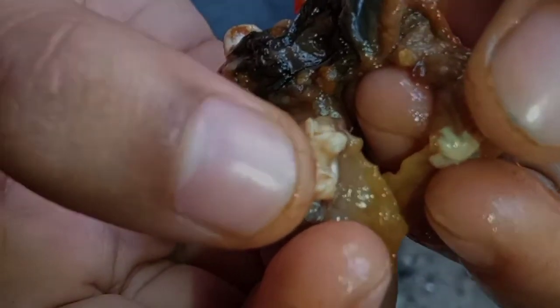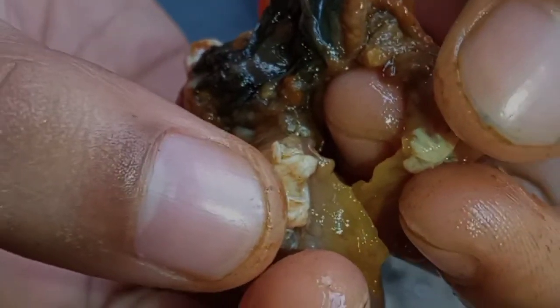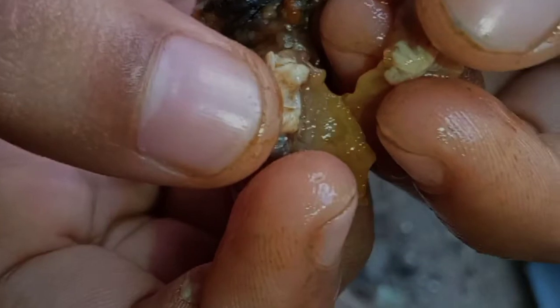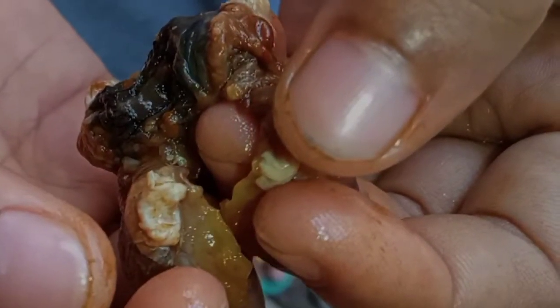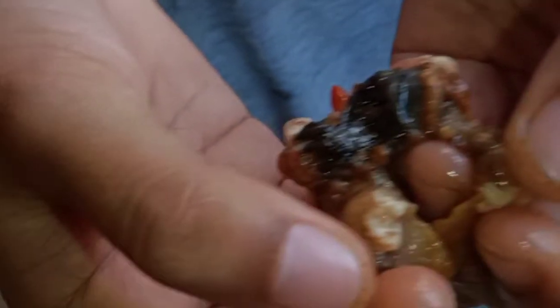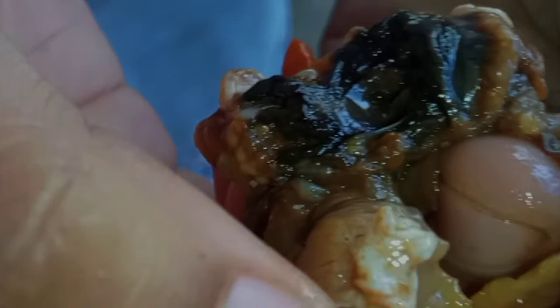The stomach is completely surrounded by the digestive diverticulum or gland, a dark mass of tissue that is frequently called the liver. An opening from the stomach leads to the much-coiled intestine that extends into the foot in clams and into the gonad in scallops, ending in the rectum and eventually the anus. Another opening from the stomach leads to a closed sac-like tube containing the crystalline style.